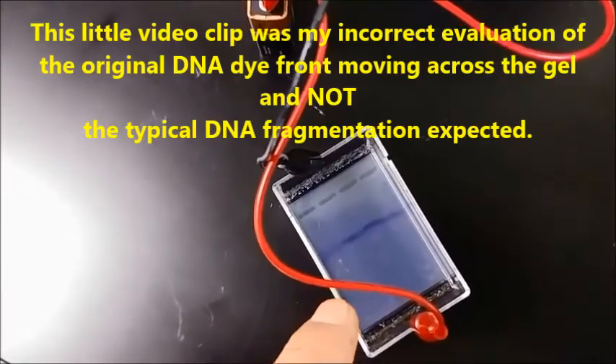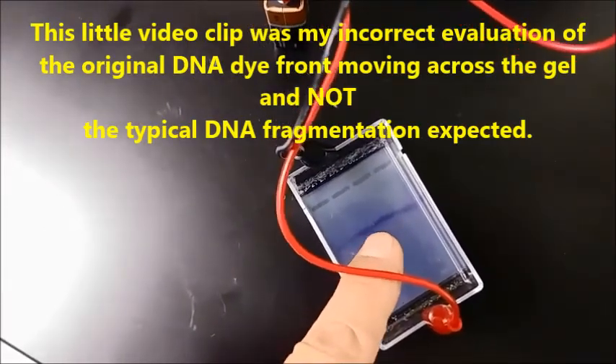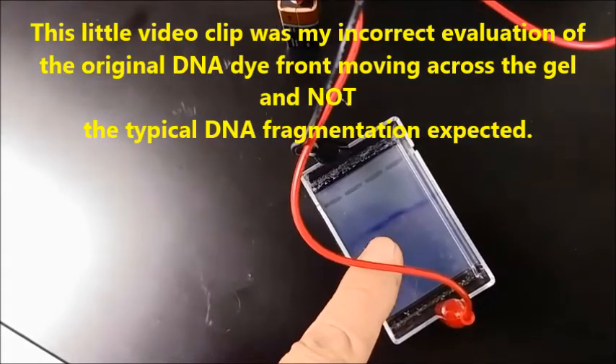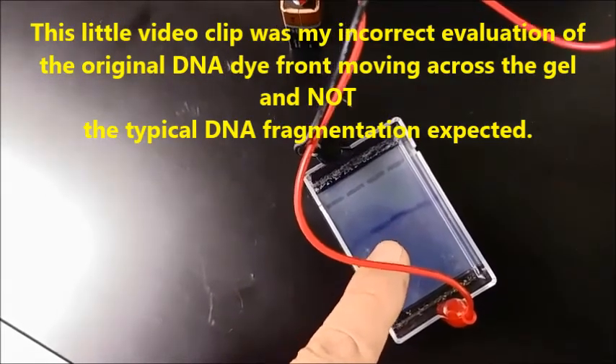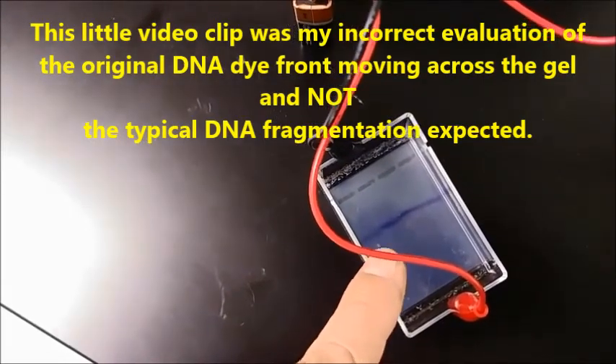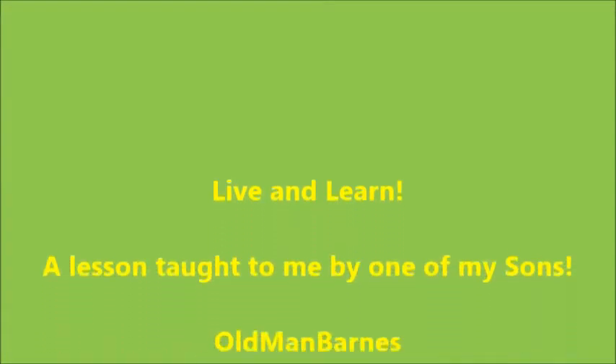After about 45 minutes, I'm starting to think that suspect two matches the evidence. Suspect one is a little bit ahead. This is the victim over here.